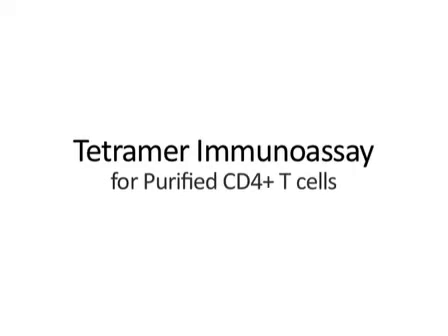This procedure will purify and expand antigen-specific CD4 positive T cells and visualize them using tetramers.